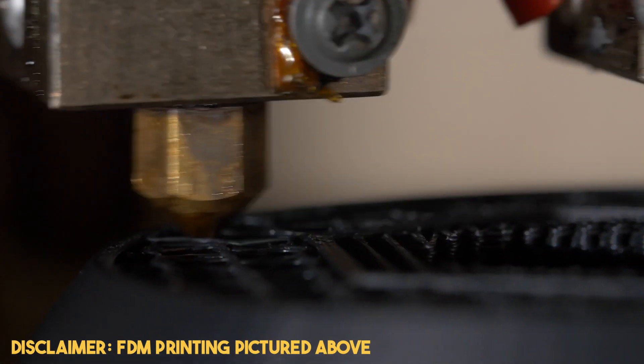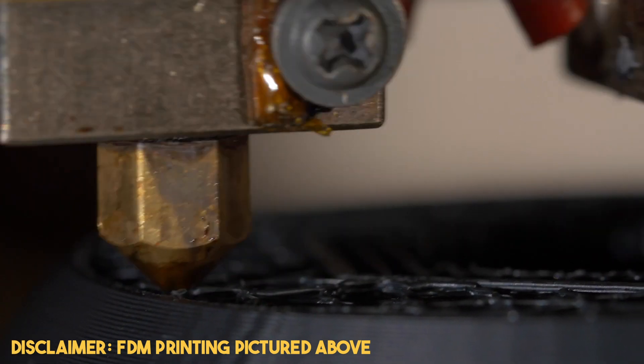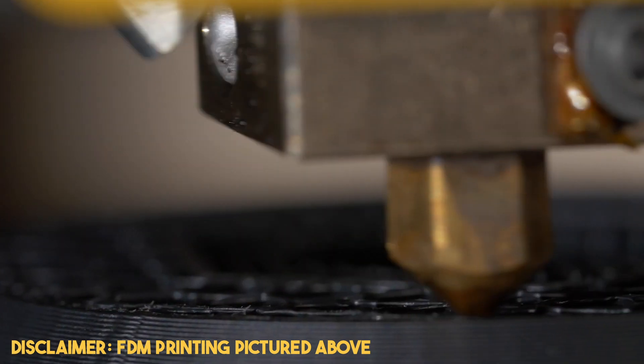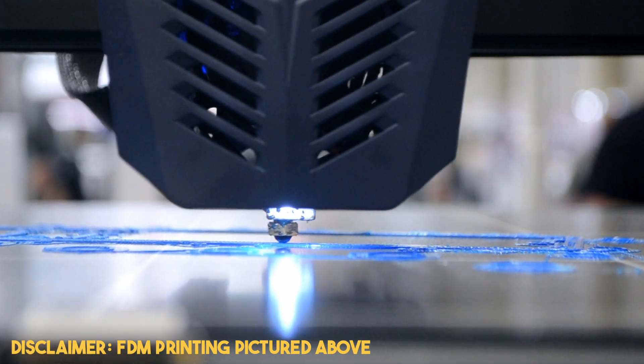Extrusion printing is similar to your standard filament printing, also known as FDM or FFF, and it's the most accessible type of printing out there. Bioink is deposited through a nozzle in layers to form a 3D shape.